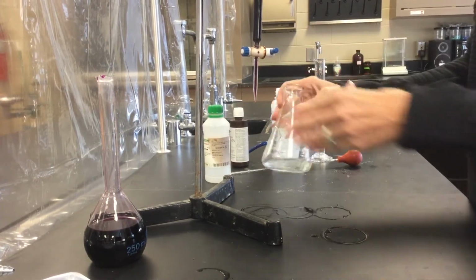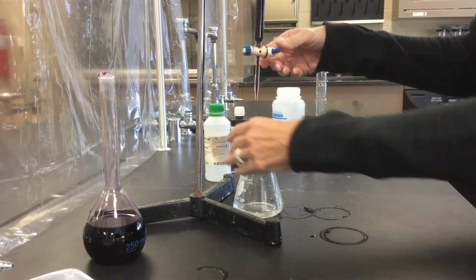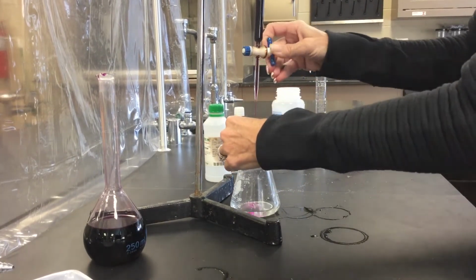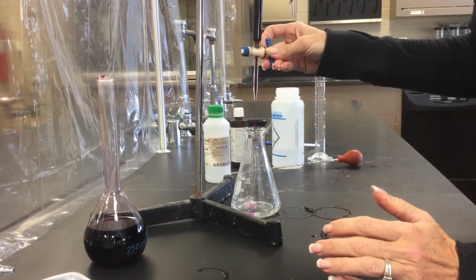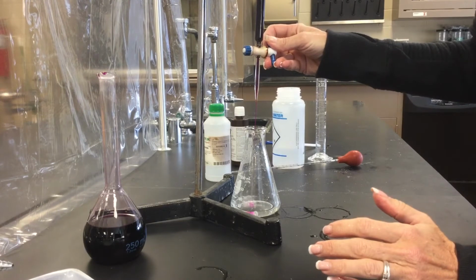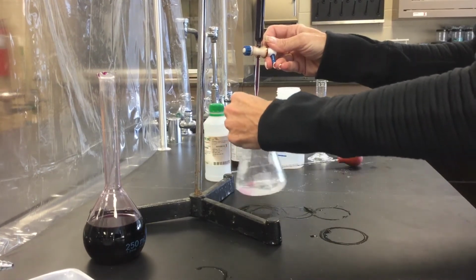Make sure it's all mixed together. Okay, so we had about 16 milliliters for the first trial, so I'll go pretty fast here. In the beginning, that was a pretty good first trial, so we'll get close to about the 30 milliliter mark, then we'll start slowing down.